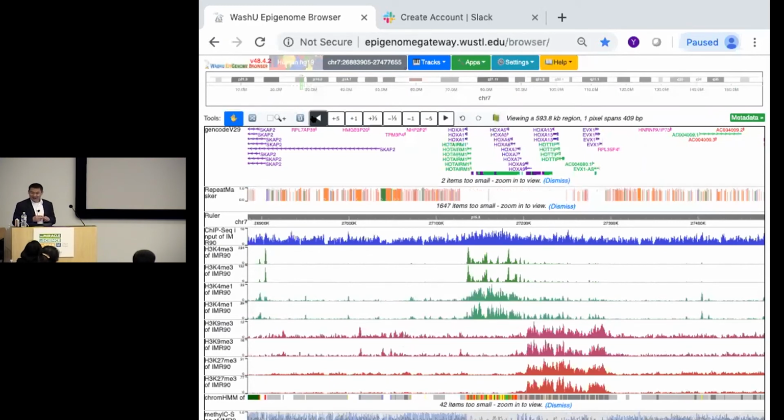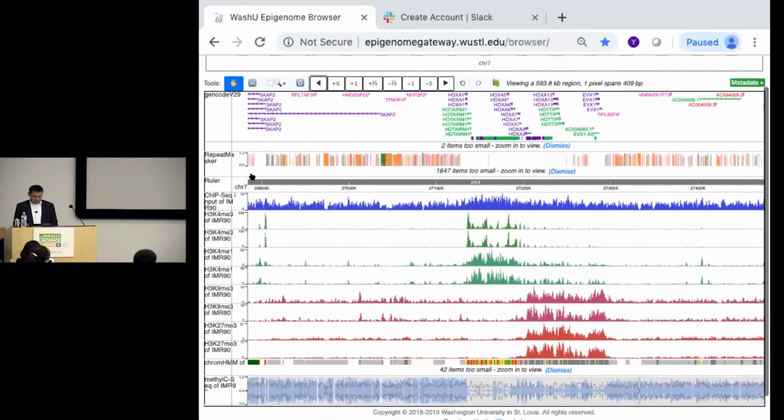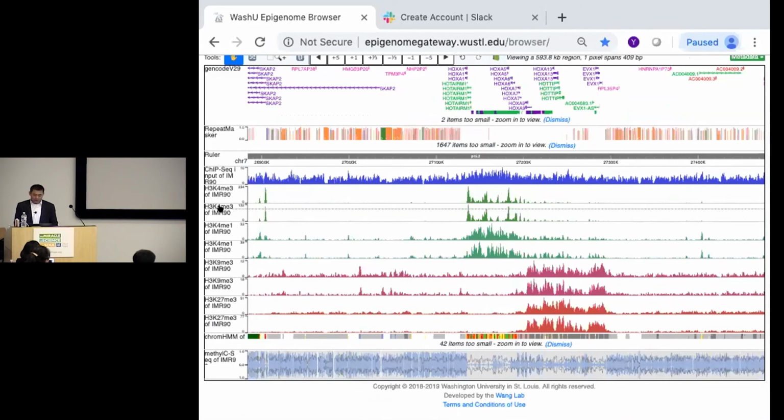So I don't know if this interaction is kind of reasonable, I think. Okay, so now we added some genomic data. I'm just going to very quickly go over this genomic data.